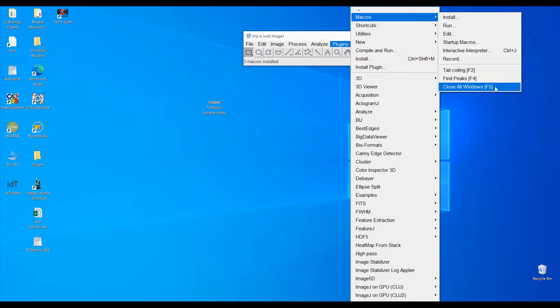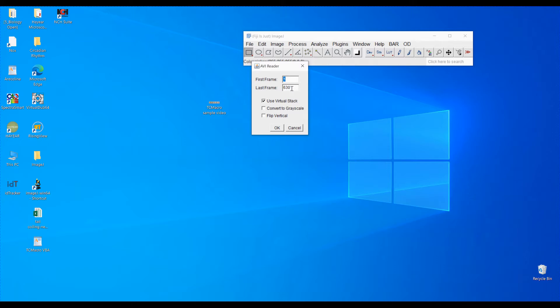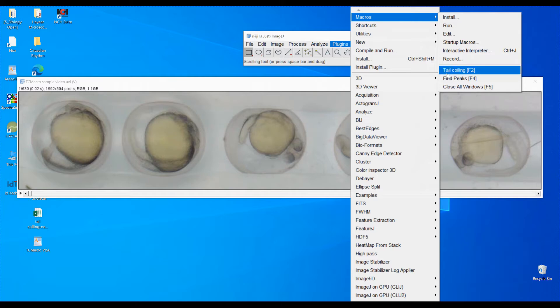First we open the video. This is the sample video — it has 630 frames and it will be cut to around 600 frames because the first 30 frames will have errors, so it's okay. You just need to give some spare frames. Click and it will open the video. Then we can run the macro by clicking Tail Coiling here, or press F2 on your keyboard.